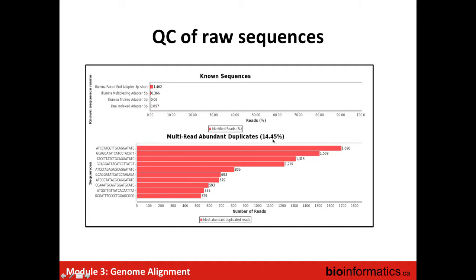What we also do, directly from the FASTQ, is estimate a raw percentage of duplication in your data. Duplication means reads that represent the same initial molecule, and you don't want them. You want the maximum of reads that represent different molecules, because if you have 100 reads that represent the same initial molecule, you don't need them. If you have an error in this molecule at the beginning when you do the first PCR, you will have this error 100 times. You expect to have a large diversity of molecules.